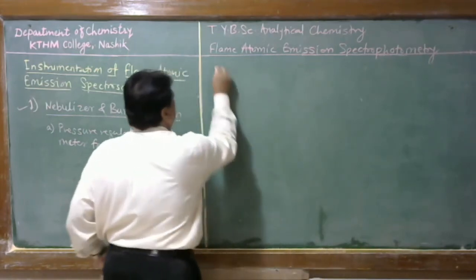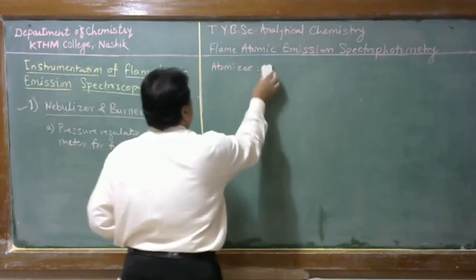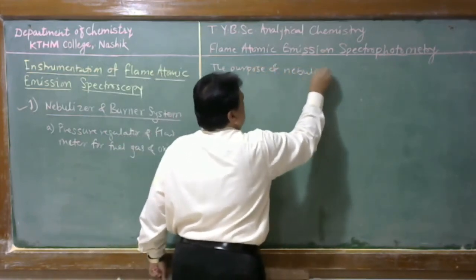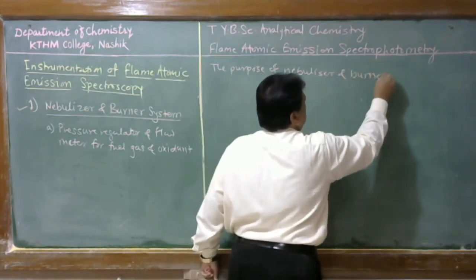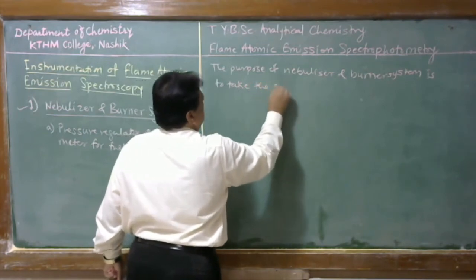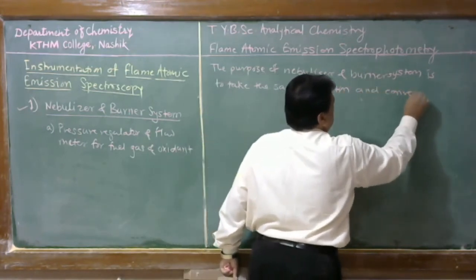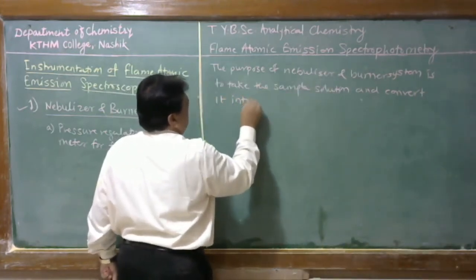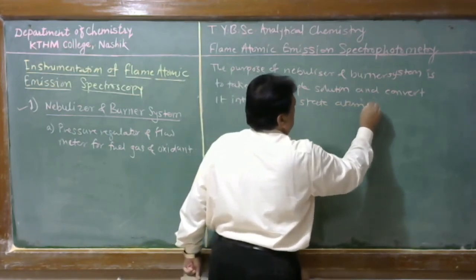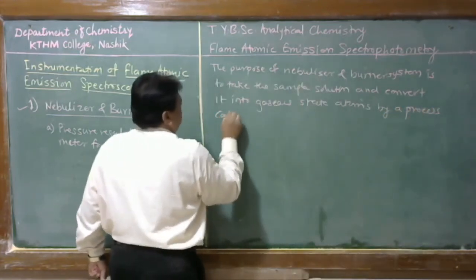Students, the purpose of the atomizer, or the nebulizer and burner system, is to take the sample solution and convert it into gaseous state atoms, and this process is called atomization.